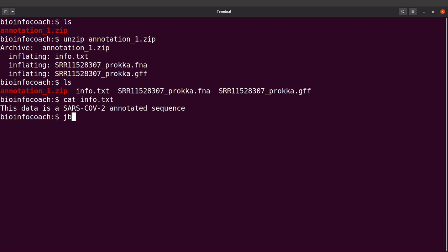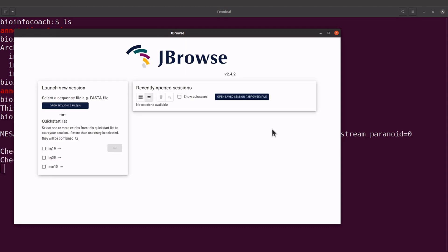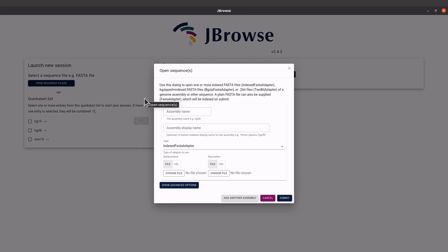Now that we have our data we can proceed. Let's call JBrowse again — type jbrowse and execute it. JBrowse opens; let's enlarge it. To open a file, come to the left side and click on Open Sequence Files.